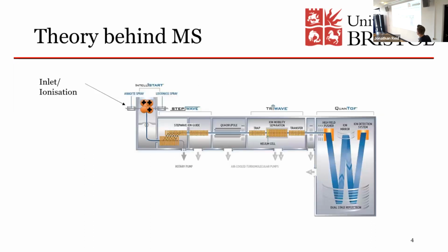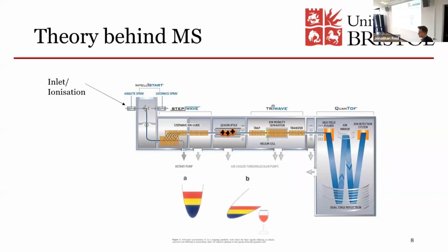So, just to go through my awesome diagram here that will have this great animation that you'll see. These are just some ionized molecules, and I'll talk about how we generate those in a sec. They'll move through the mass spectrometer, and you'll see some of the neutral particles move away from these charged molecules, as there's a slight kink in the trajectory of the mass spec, and then these are guided into a beam that passes through this quadrupole here, similar to what Jamie's using actually.